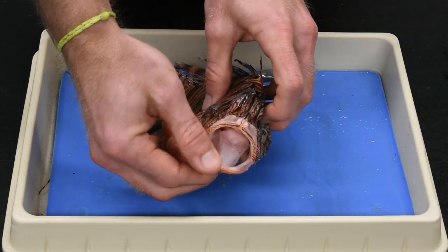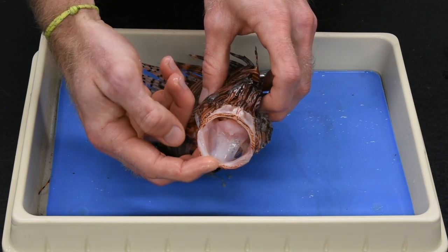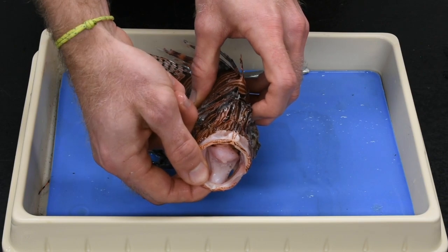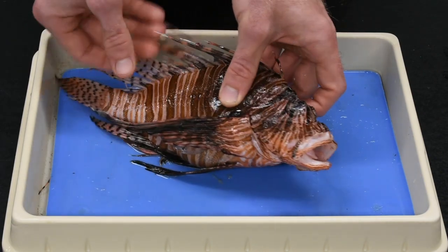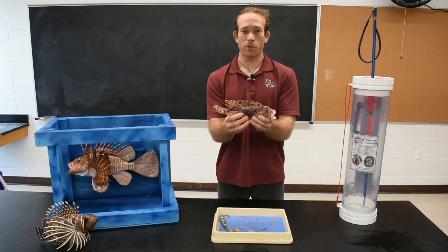I'll also show you the gape, or mouth opening, of the lionfish. Lionfish can consume prey items up to half their body size, and they have a powerful protrusive jaw that acts somewhat like a vacuum cleaner to suck up prey items whole, which is very useful for an ambush predator.